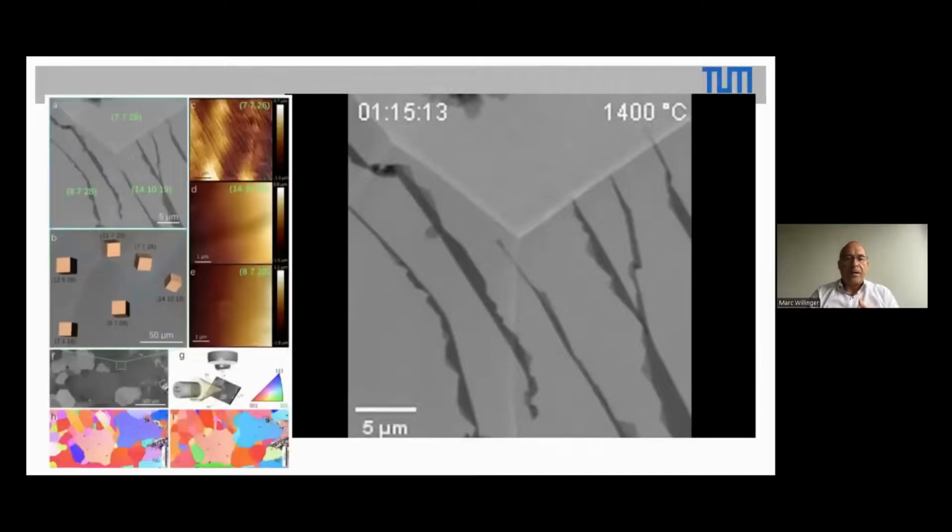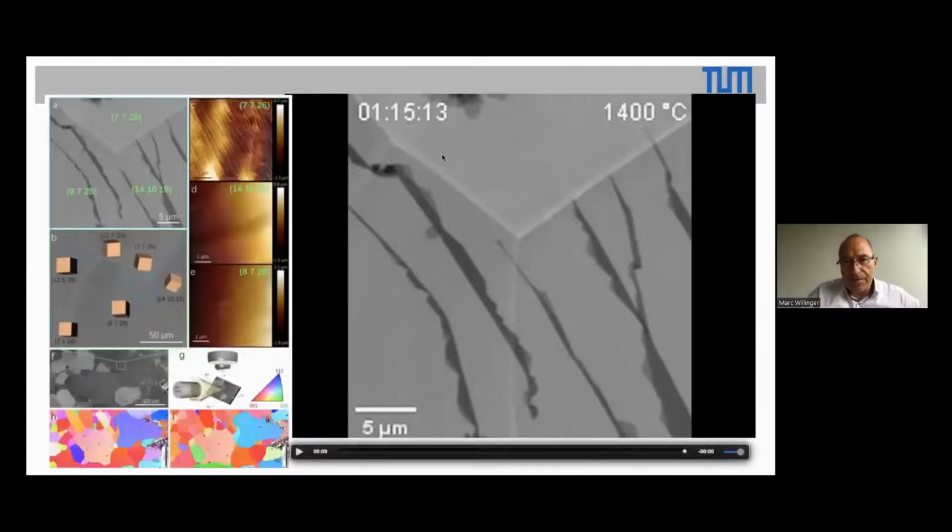So we have analyzed the surface structure of this grain and that grain. We saw that this grain here is stepped. It has a graphene film, but when you have this stepped graphene film and you suddenly make the surface flat, then the graphene is just loose. And what we actually form is wrinkles. And the wrinkles collapse and fold over.